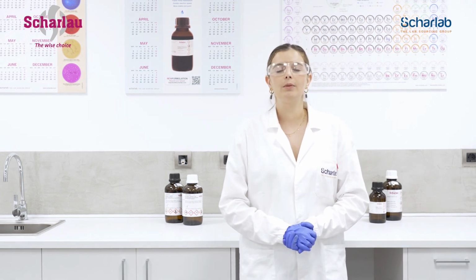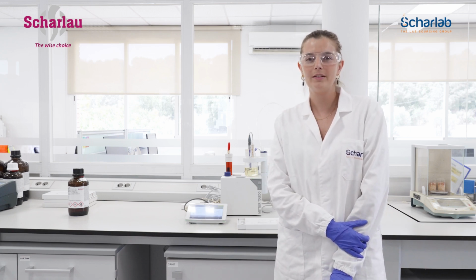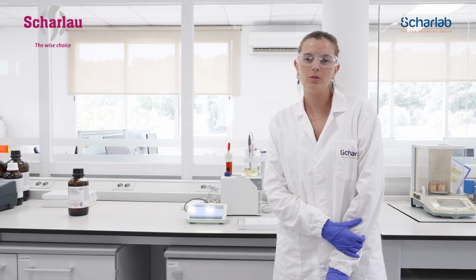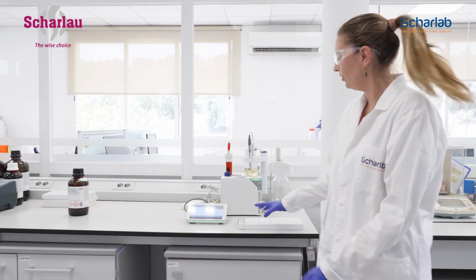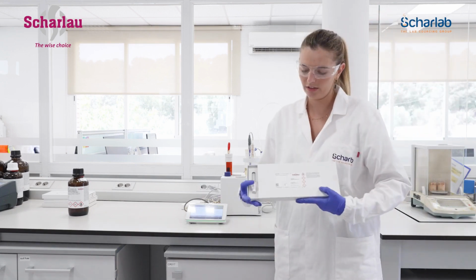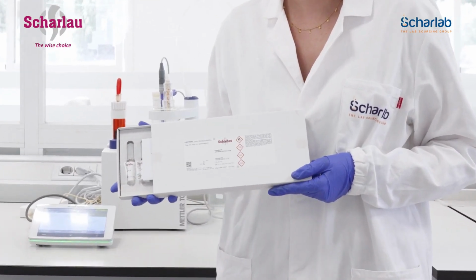To finish, we are going to measure the water content of a coulometric sample. For today's demo, we are going to use a Mettler Toledo T7 coulometric device. This device can be used as either coulometric or volumetric, but today we will use it as coulometric. Previously, we calibrated the device with one of our standards, AQ0019. This contains 0.1% water and is suitable for coulometric method.